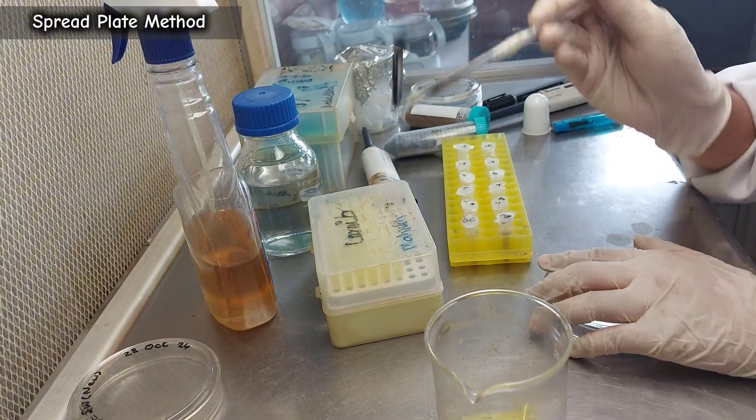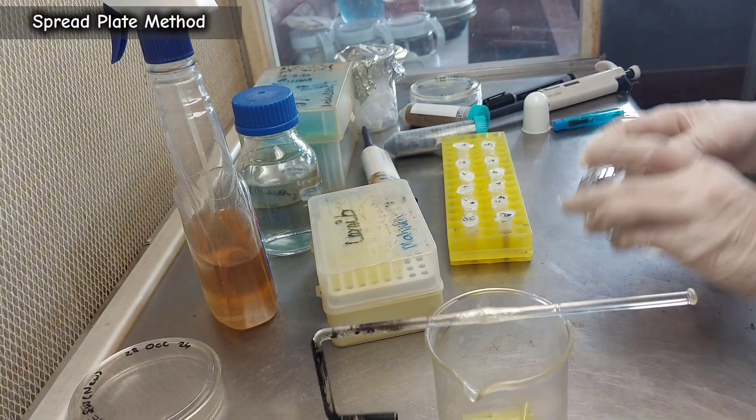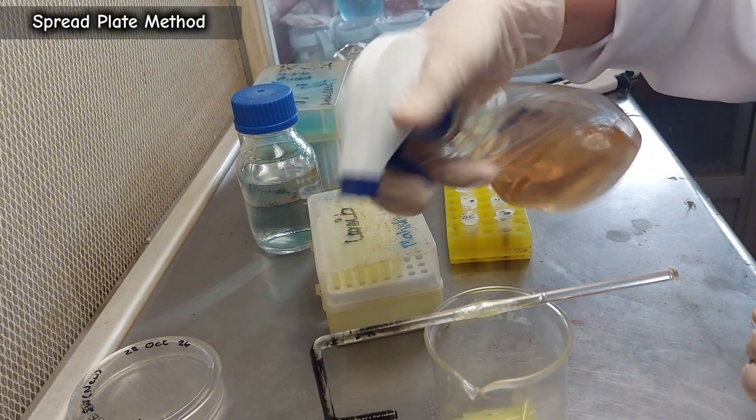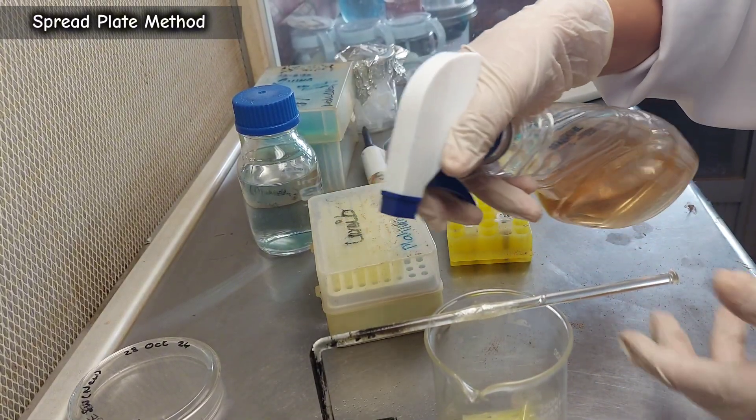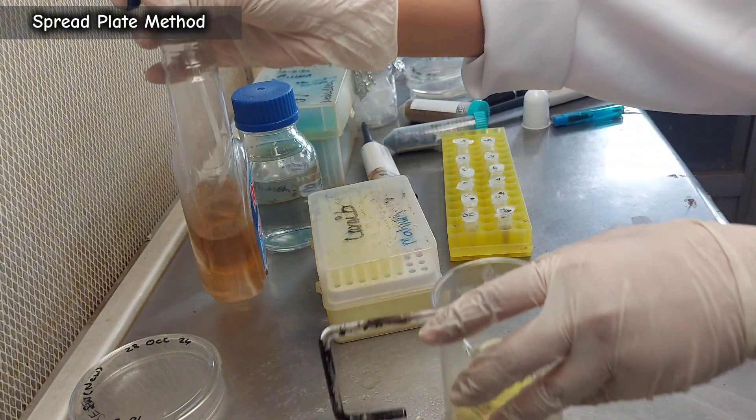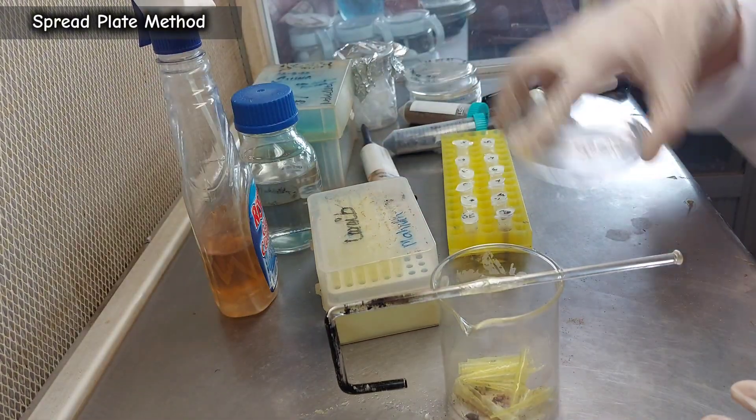Repeat this step for the other dilutions, sterilizing the spreader after each use. In this demonstration, we will plate dilutions from 10 to the power of negative 3, 10 to the power of negative 4, and 10 to the power of negative 5.